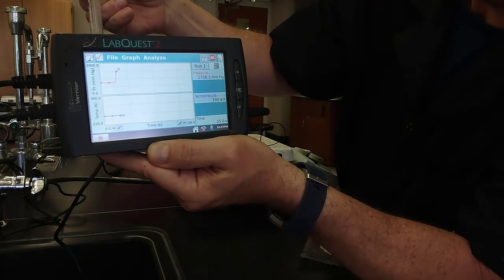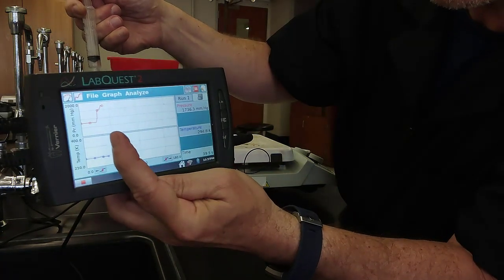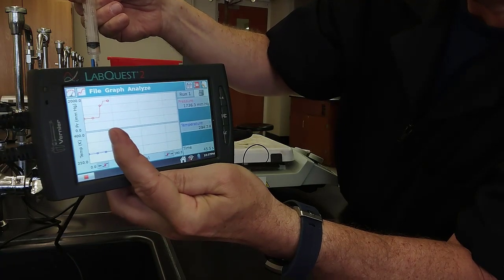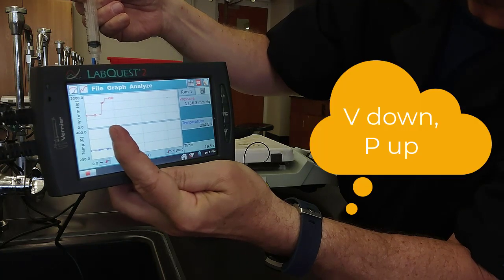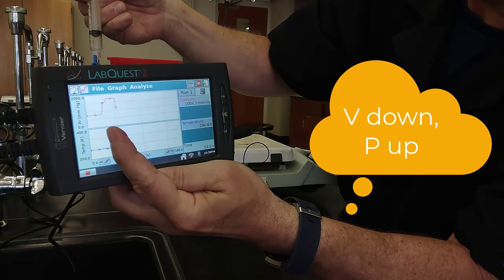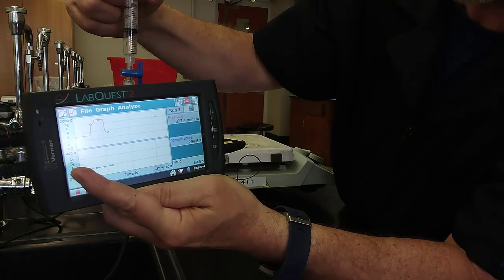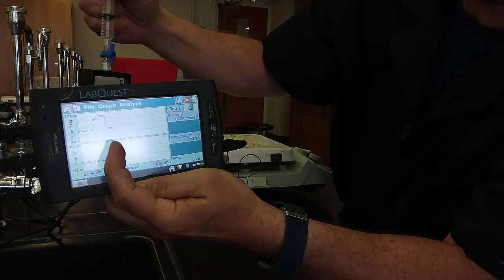I'm down at 1.25, and you can see that the red line has gone way up. The pressure increased when I decreased my volume. Volume down, pressure went up. Now I'll let it back to its original 2.5 milliliters. And you can see that our pressure went back to atmospheric pressure.